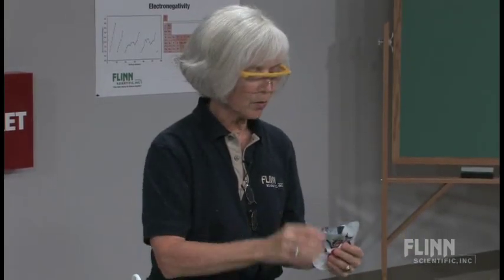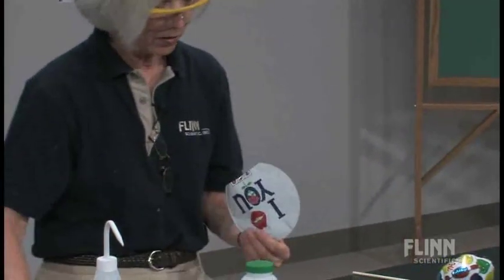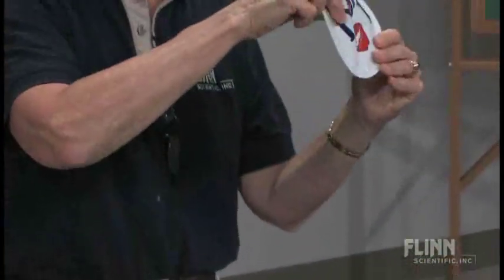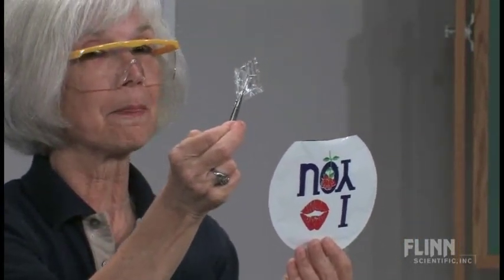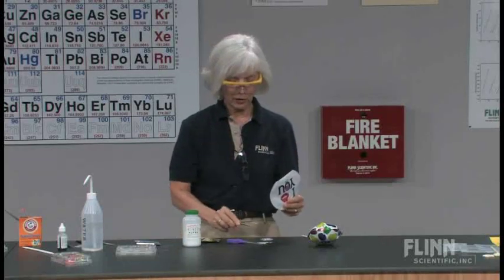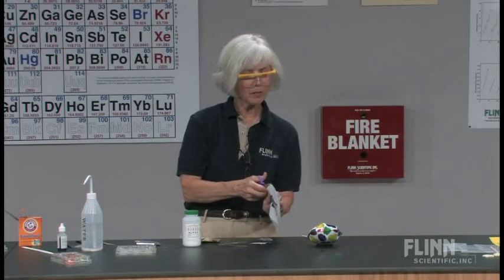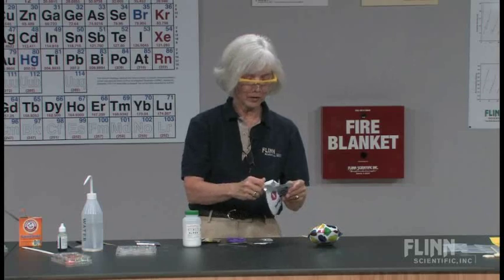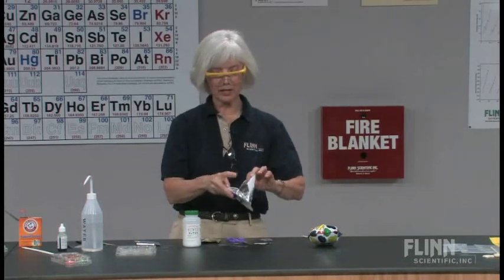So they cut it open. Is that one going to explode? I don't think so. They cut it open so that they can reach inside here. And what we've got also is a little packet of water, right? And then I have them analyze this. And there's also a white solid. So we'll just cut this all the way open. With my students, they would be dumping out the white solid because they have to figure out the volume of the balloon. But anyhow, they can see that there's a white solid in here.